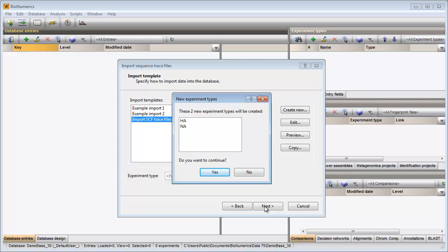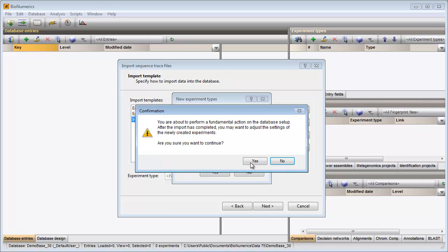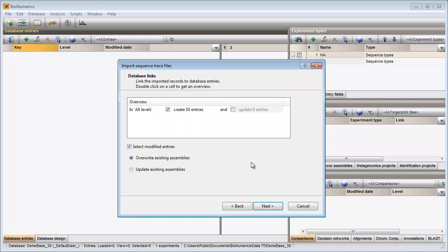I confirm the creation of the two missing sequence types in the database and the creation of 10 new entries.